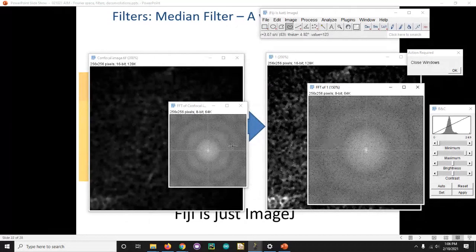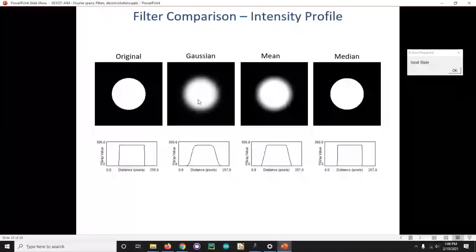So this is our library of standard filters. This is getting to a better understanding of what these filters are doing. So here's our original signal. You can see our Gaussian is very much like sanding. It sands off the edges and rounds them off, as we expect, because it's purely a low pass filter, so it's removing any sharp transitions. Our mean, you can actually see it keeps sharp edges. There's a sharp edge here and a sharp edge here, because you suddenly transition from no image to the mean of the ramp. So you get this ramp effect.